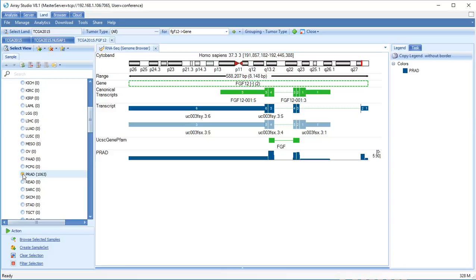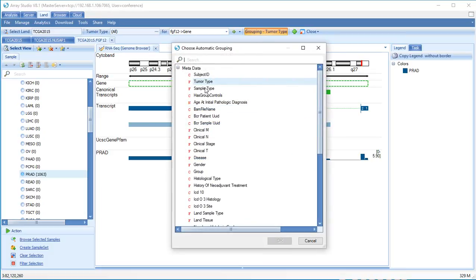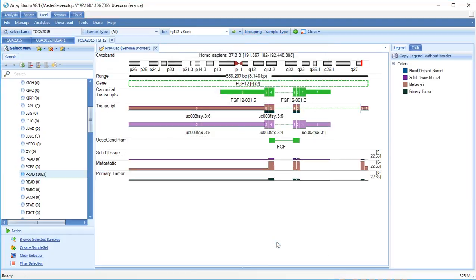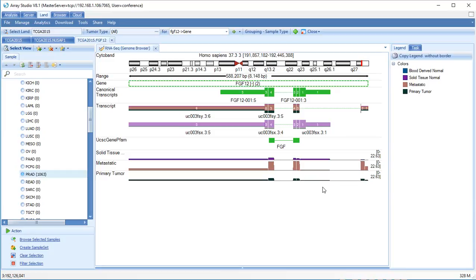To compare between tumor and normal, we can change grouping to sample type. Here, exon level coverage is shown. First, look at the overall expression levels at the bottom. Notice that metastatic samples express FGF12 much more than other samples. It turns out, however, that this is a single sample in the dataset.